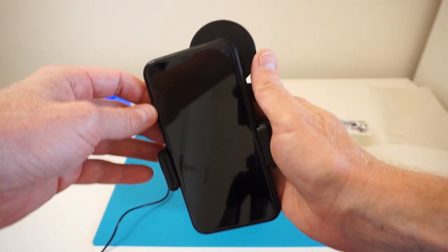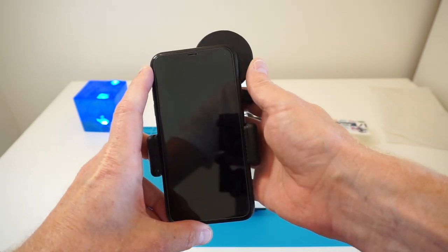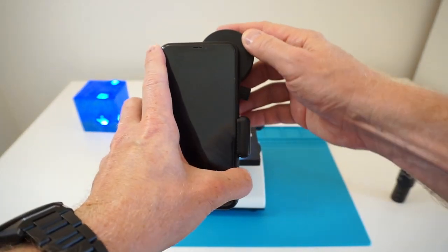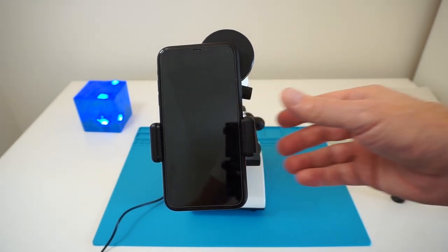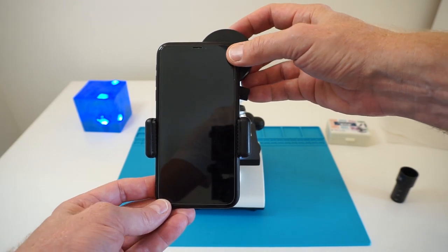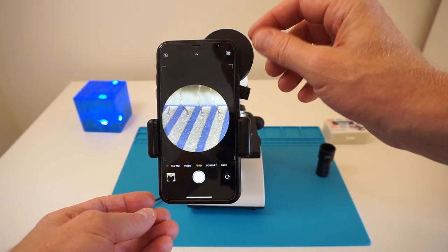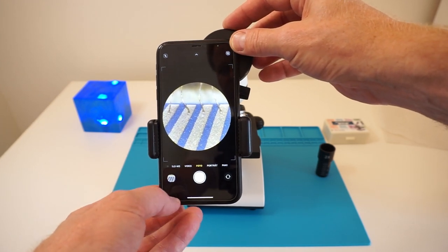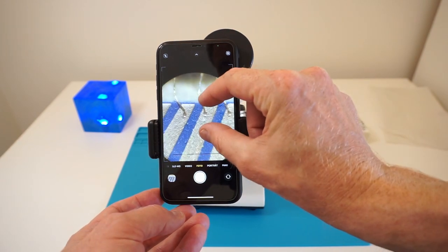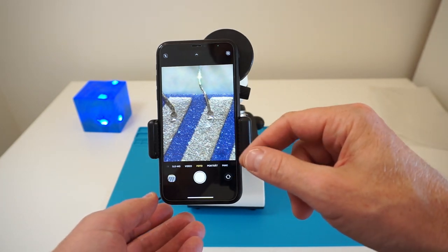Well, then I'm mounting it directly without the tube. So I will start with the lowest magnification. I will mount it here. And as you see, it holds directly, which is quite neat. I mean, it's not very stable, but it doesn't have to be, because as long as you're not moving too much around, you can get really cool pictures. So now I aligned already the eyepiece, and you see it starts with a circular picture, but you can easily zoom in and then you have sort of a large picture.